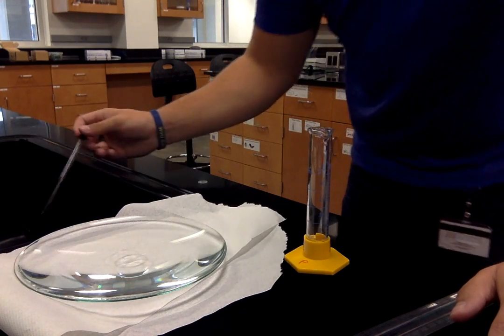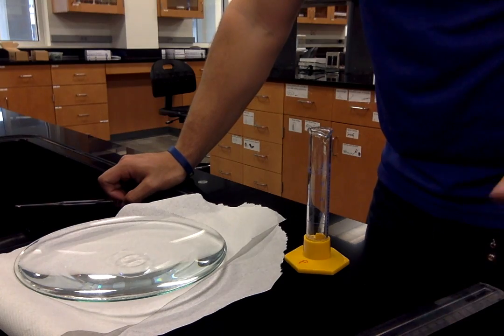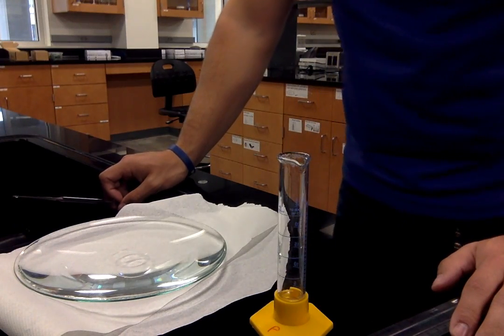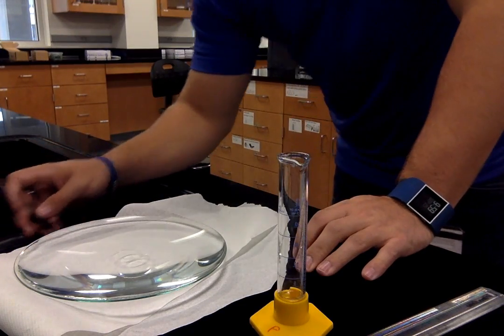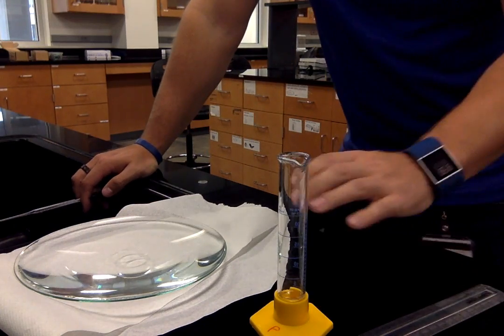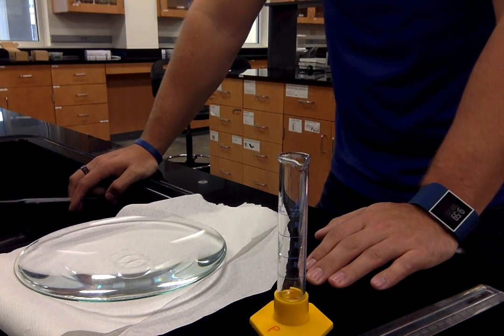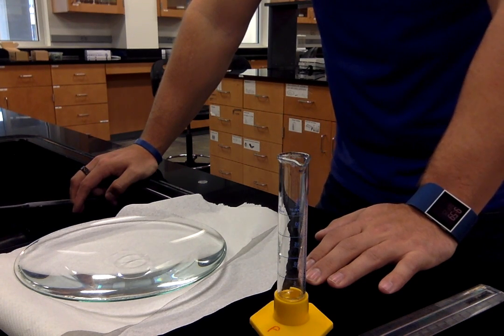Okay, so you're going to do that until the stearic acid covers the entire surface, until there's a drop and it persists on the very top of the monolayer. So it's no longer a singular layer, you have an additional drop on top. When you see that, you know that you can stop. You may start to see it whenever you're adding your drops, when you think you're close to the end, but wait about 20-30 seconds. And if it goes away, then you're going to keep adding, okay?